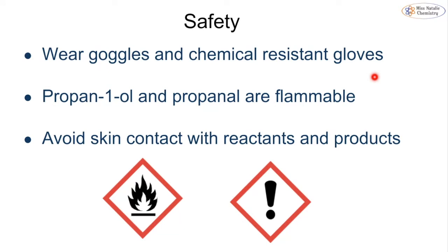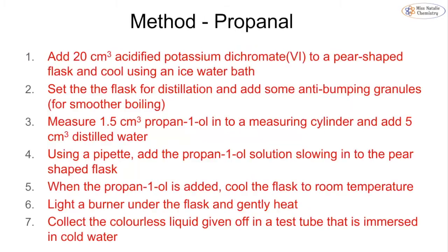For safety, wear goggles and chemical resistant gloves. Be aware that propan-1-ol and propanal are both flammable, so keep them away from any naked flame, and avoid skin contact with reactants and products. For the propanal method, we add acidified potassium dichromate to a pear-shaped flask, cool it using an ice water bath, set it up for distillation, and add anti-bumping granules for a smooth boiling motion.